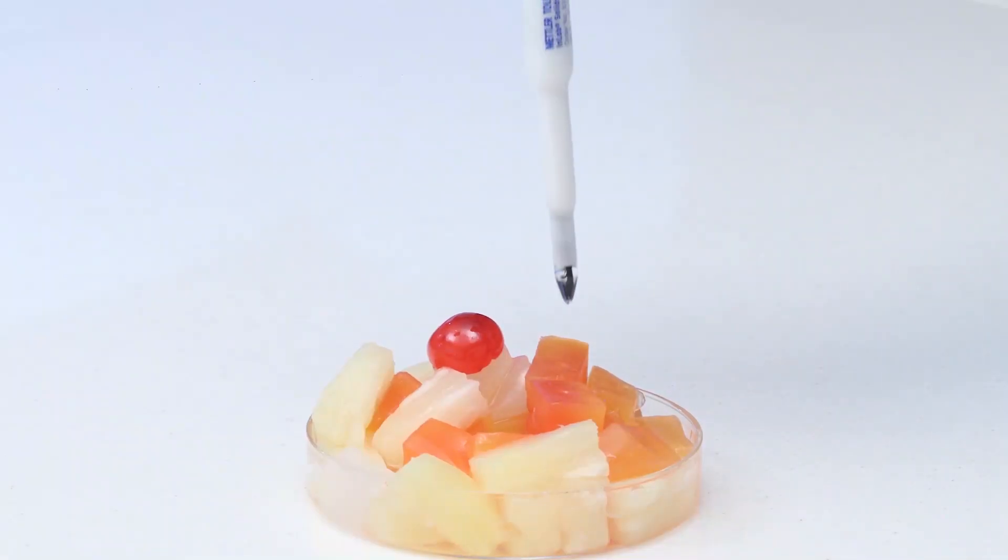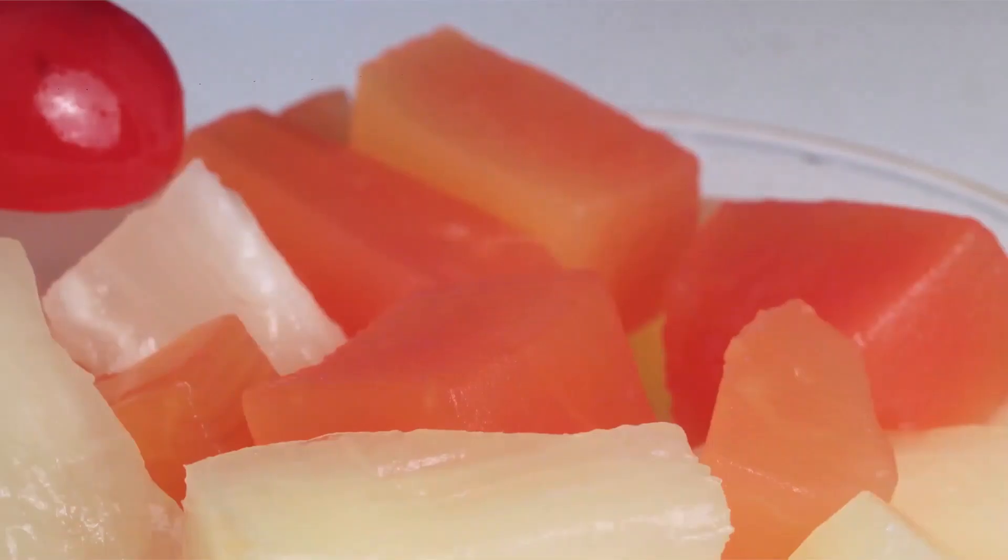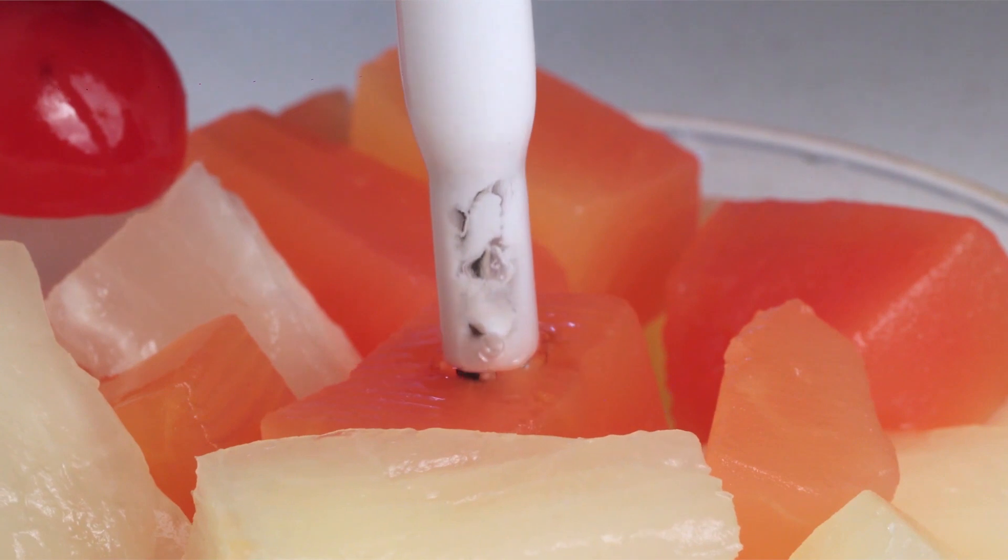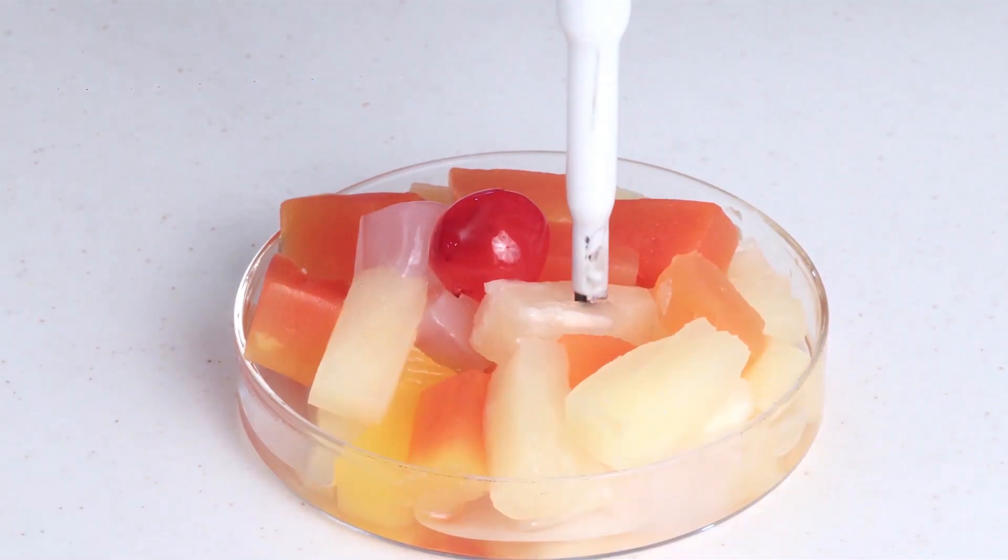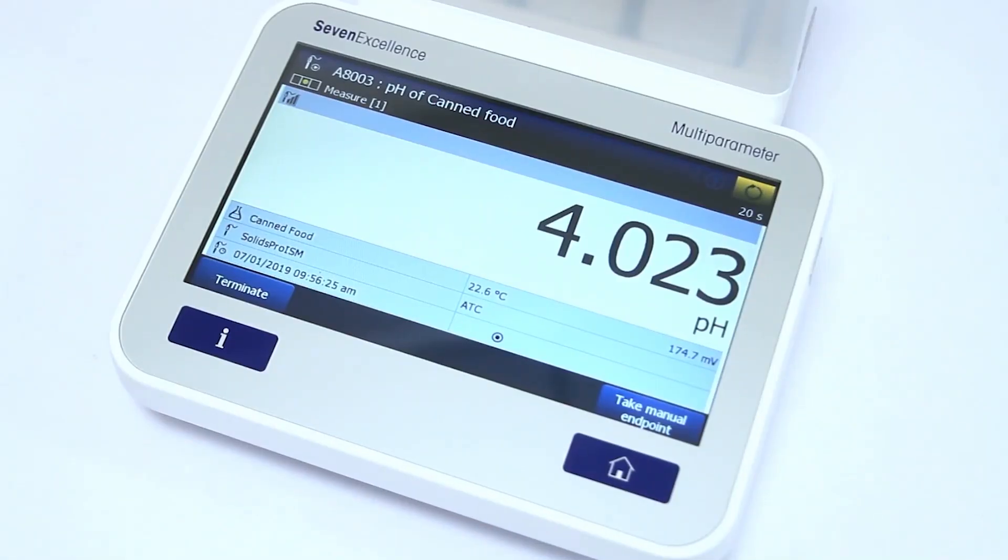Measure the pH by gently inserting the electrode into the sample. Make sure that the open junction is completely immersed into the sample. Repeat the measurement in triplicate at various positions to obtain a representative pH reading.